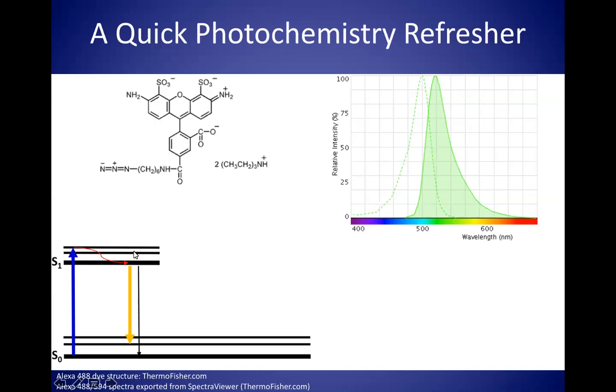This is because you always lose a little bit of energy in the excited state, typically through motion. And it always has these shoulders, and these shoulders come from substates that are accessed through motion again. So these are vibrations and rotations that allow a little bit of wiggle room in jumping between these states. So a little bit of freedom in how well that energy has to match.